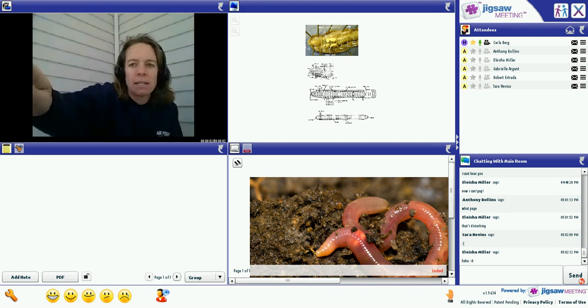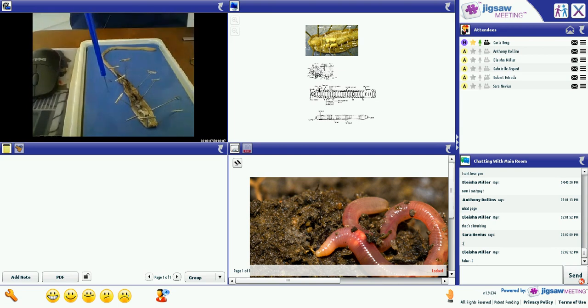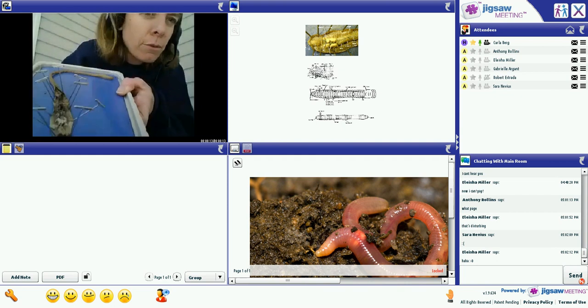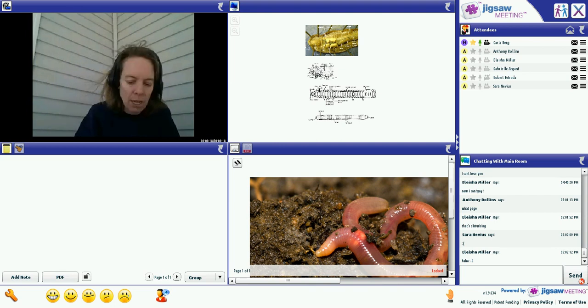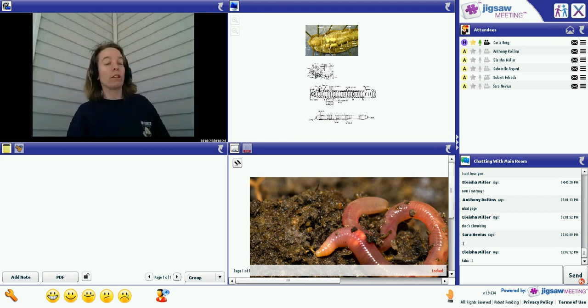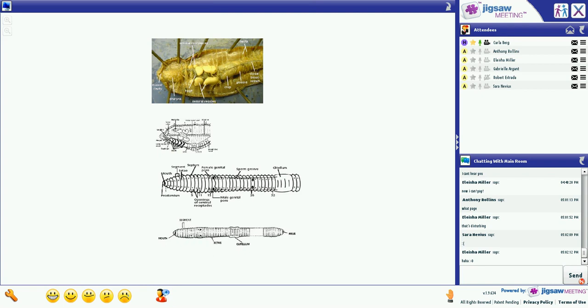I'm going to turn my camera on in hopes that I can show you mine. Let me see if I can do this easily here. Up here, it's not going to work. There are little arches. Those little horseshoes are called aortic arches. Like I said, sometimes you see them very well, sometimes you do not see them well. They are not to be labeled anywhere on your screen or on your diagrams. But my worm had some good ones.